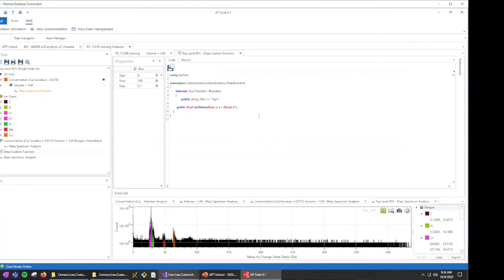All right. Yeah. Yiming is telling me I have a file I could use. Hang on just a moment here.